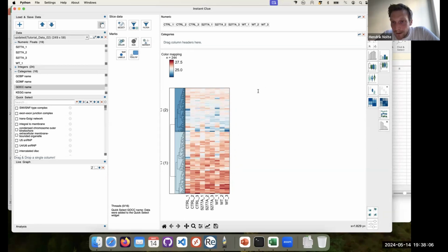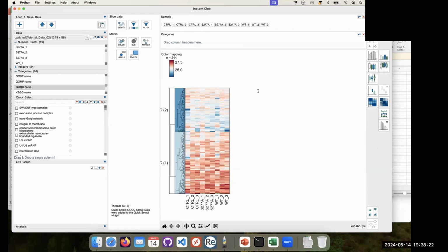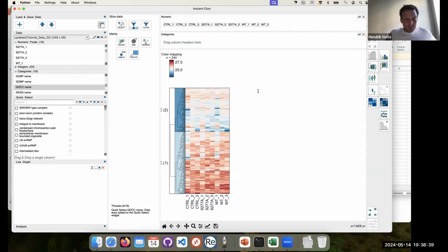Sorry, I'm reading. I don't know if you see it actually. Can we add the p-values as symbols in the plot? Not in this whole big one, but I have seen publications that have the heat map, and then if there is a real significant difference, they add the stars to each of the genes, to have a big overview of the genes that are significant.